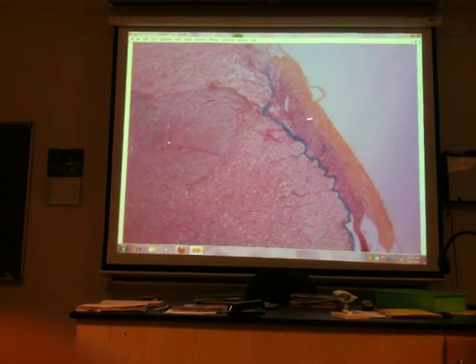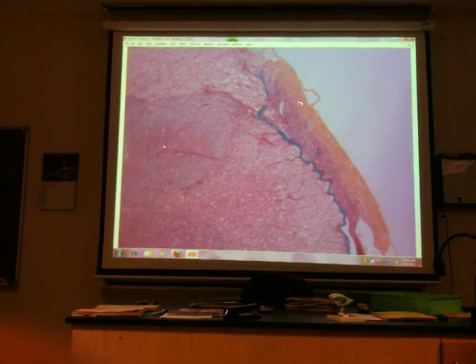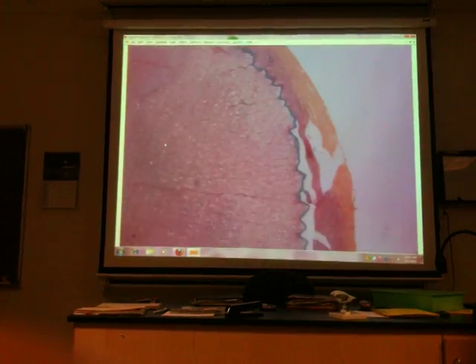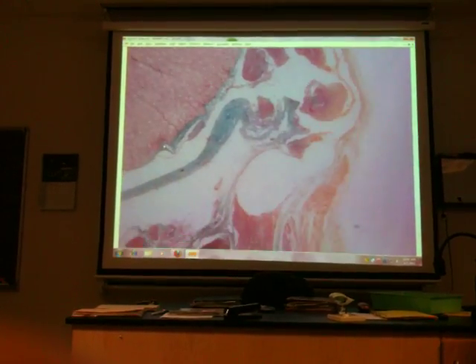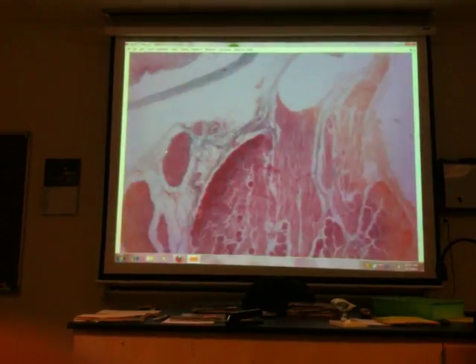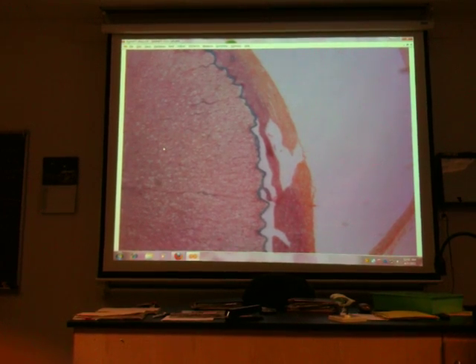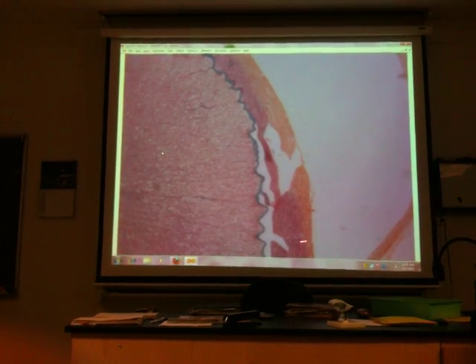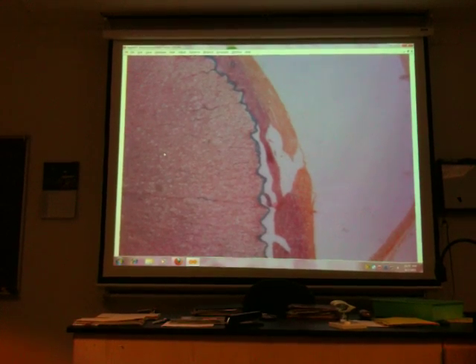We're looking instead at this larger structure which is either going in or out of this posterior gray horn, and that structure is being pulled alongside the cord and is going to end up in this swelling. There's artifacts here. It's been busted up a bit. Name this structure, back table. Dorsal root. It's the dorsal root of the spinal nerve.